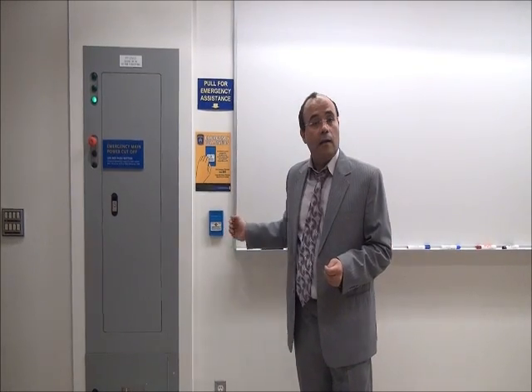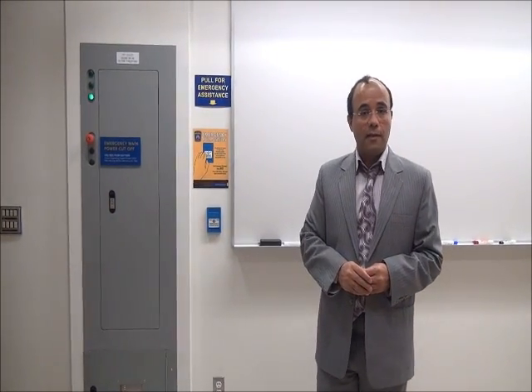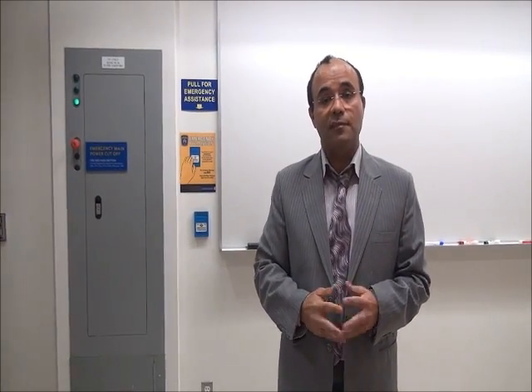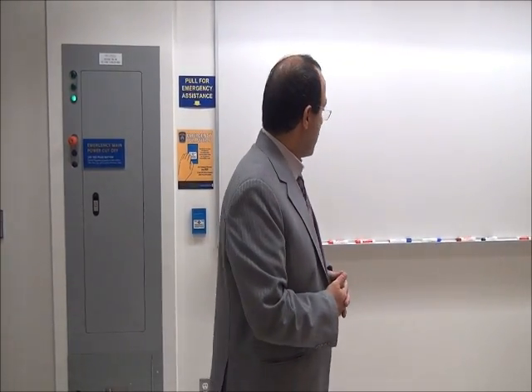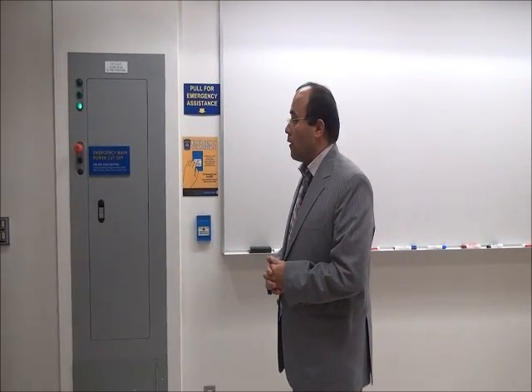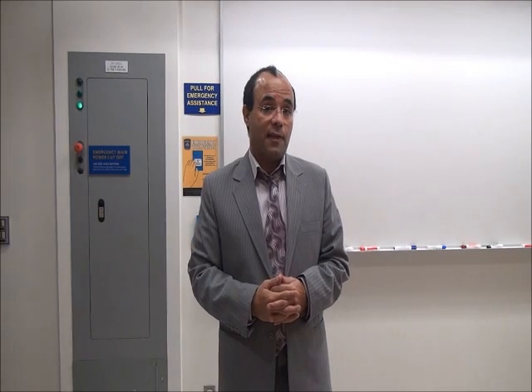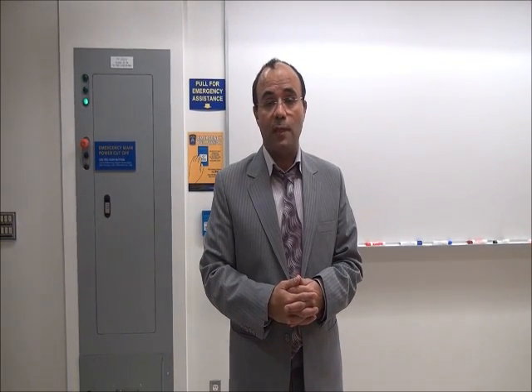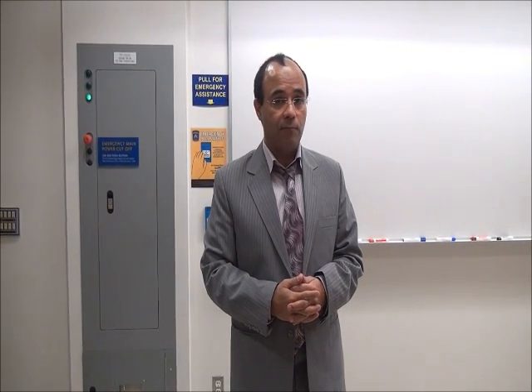An emergency assistance key is also available. We haven't used this, so hopefully everybody is going to take the precautions and things are going to go relatively safely for everyone. Another thing to mention is that students are not supposed to be in the lab by themselves — there has to be a TA in the room.